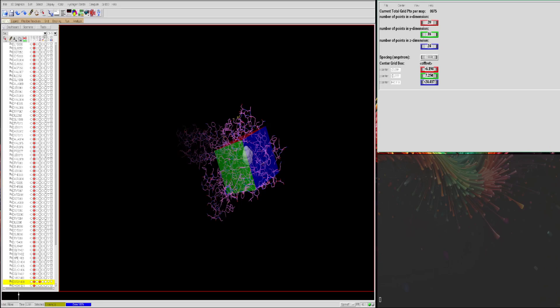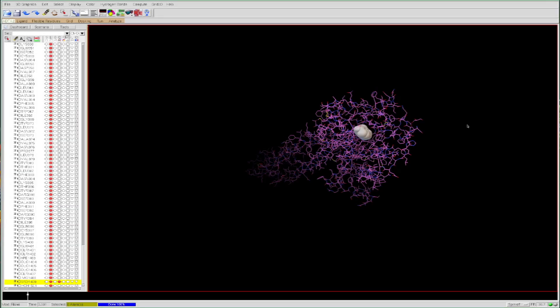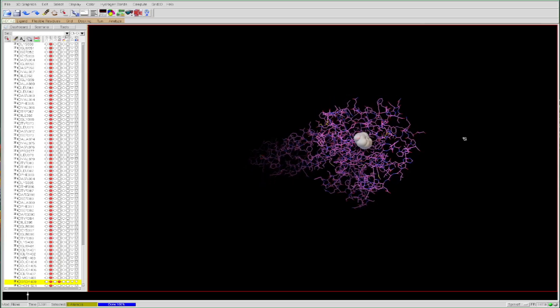Now that we have this region selected, we'll want to note down all of the relevant data: the number of points in each dimension, the spacing, and the X, Y, and Z center coordinates. We'll write all of this down and keep it for when we actually run the calculation.